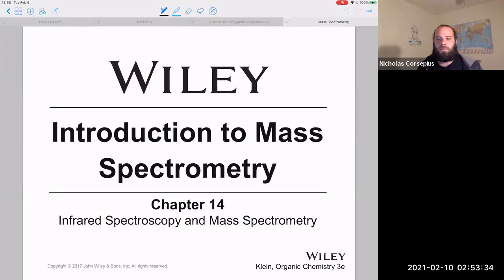Hello, everyone. So this week we're going to take a bit to talk about an important analytical technique that we're going to be using throughout this semester called mass spectrometry. This is something that we're actually going to be using to analyze our samples after we perform our in-home lab experiments. So this week is really going to be kind of like a lecture week where I give you the background information as well as the tools to analyze mass spectra.